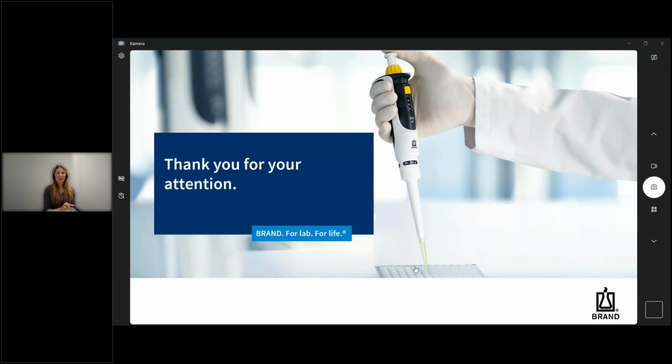That's also a good question. No, the PLT unit cannot be used to check steppers, because steppers are direct displacement pipettes, and the PLT unit is designed only for air displacement pipettes. But it doesn't matter which manufacturer. It works for all air displacement pipettes, but not for direct displacement pipettes.